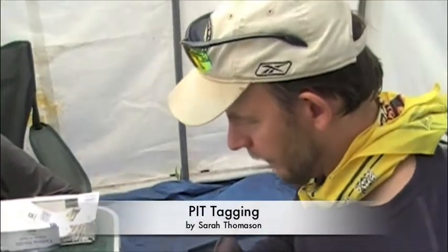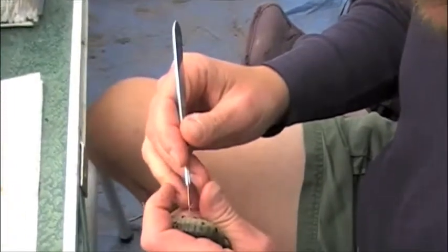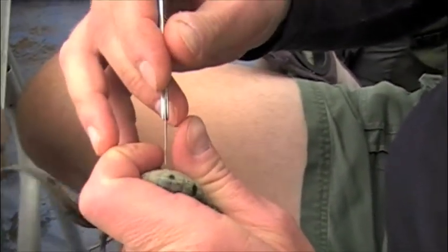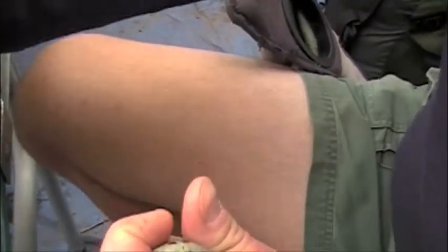Here we go. We're going to use the scalpel. Count six costal grooves. Try not to get nailed by the tail.